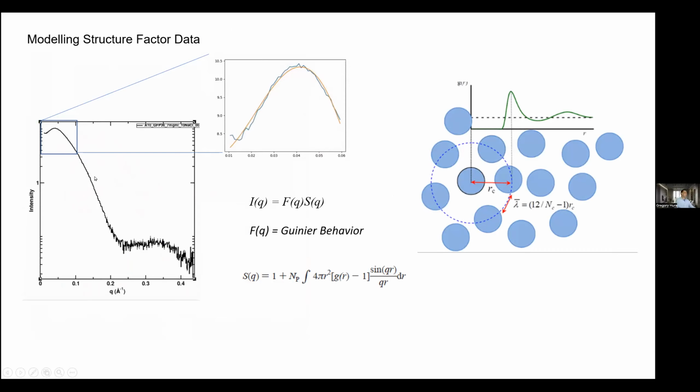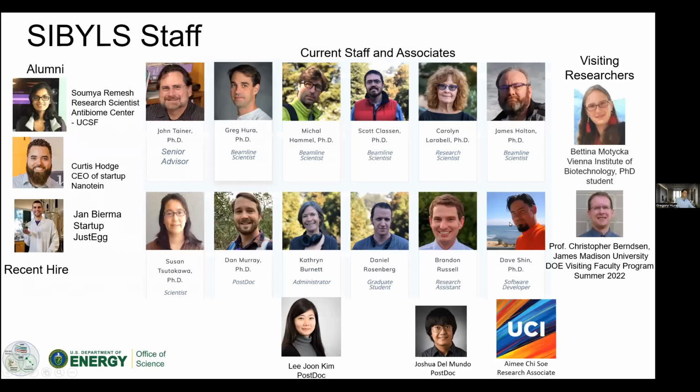Thank you, Catherine. And then there's data with structure factors, for example, and this is because, let's say, a charged GFP does not want to be close to another charged GFP, so it's restricting it far away. So fitting that function, like there's some repulsion going on. So learning how to use that kind of behavior, where no molecules are this close apart, but then suddenly you have a big peak, etc. So creating that. And this is my closing slide.